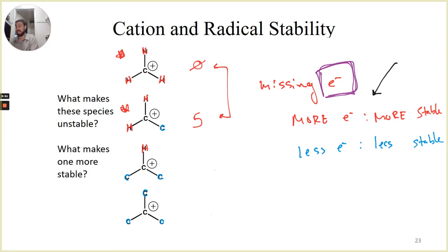Okay? The next one down, if we continue that out, we'll have 10, we'll have 15, which would suggest this bottom one is the most stable, and the top one is our least stable. And I don't know about you, but we're saying top and bottom and all of that, and that's difficult to kind of put a frame of reference on which one we're talking about.